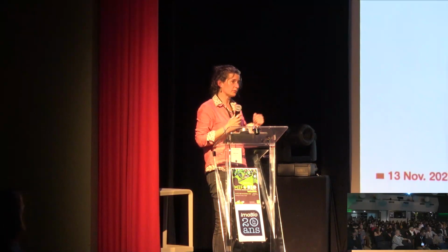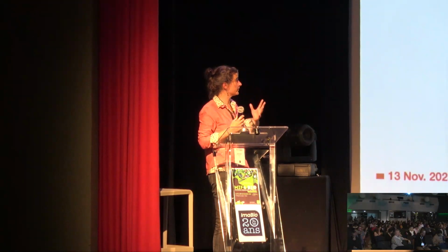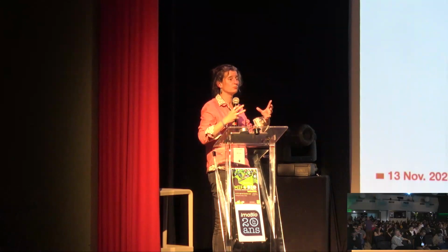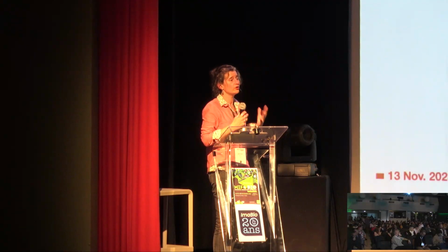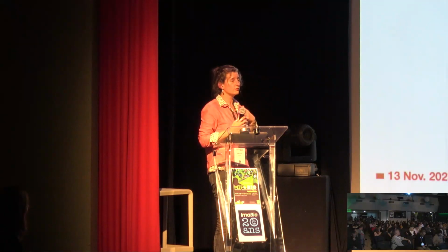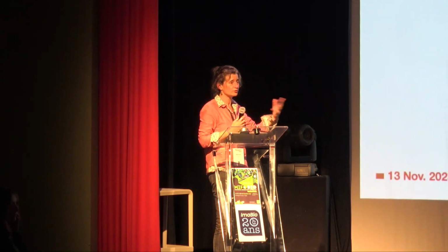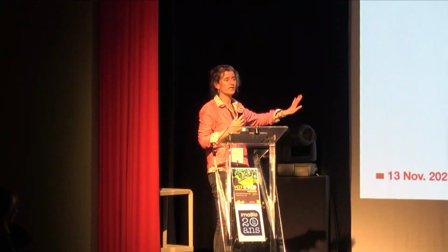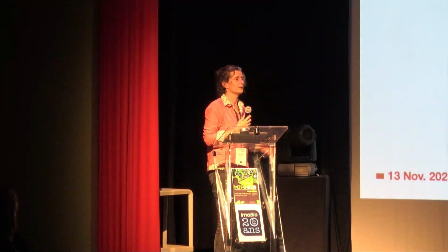But then, for example, for bigger organoids or big spheroids, and depending on whether you just want to monitor the growth, the trick is to have them under the microscope for weeks sometimes. And then you really have to change the way of thinking on how to design. Of course, booking a 2-photon microscope for 2 weeks, I cannot afford it.